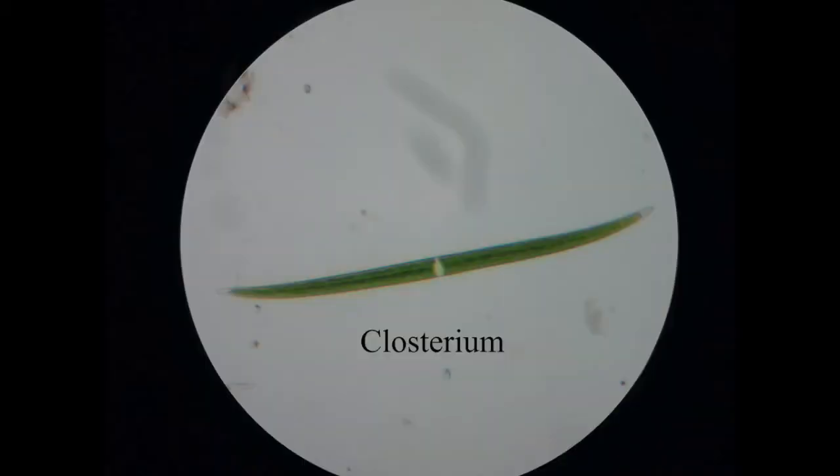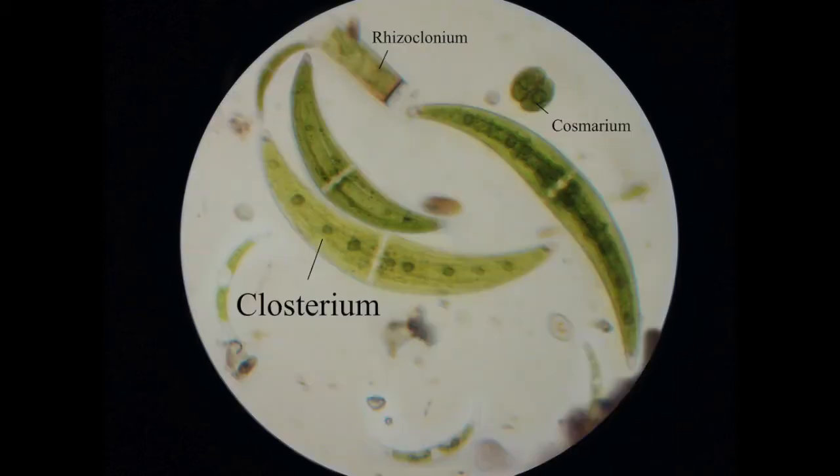This is closterium. There are quite a few species of this but they all have this slight crescent shape to them. I'll show you a couple of different types — here's a different species, and here's another, which is probably my best image of closterium. You can also see a cosmarium algae there as well. There are so many different types of algae, and a good rule of thumb when looking at pond life under a microscope is that most things that are green are probably going to be algae.